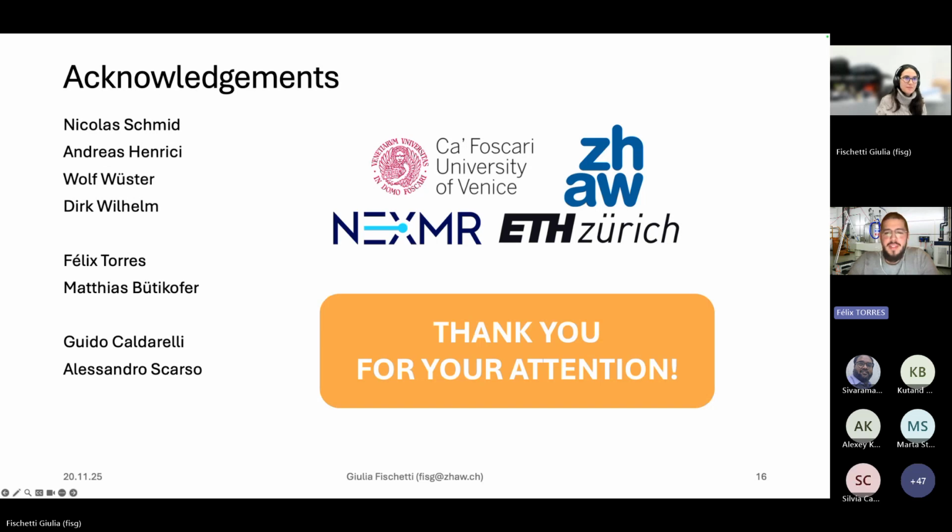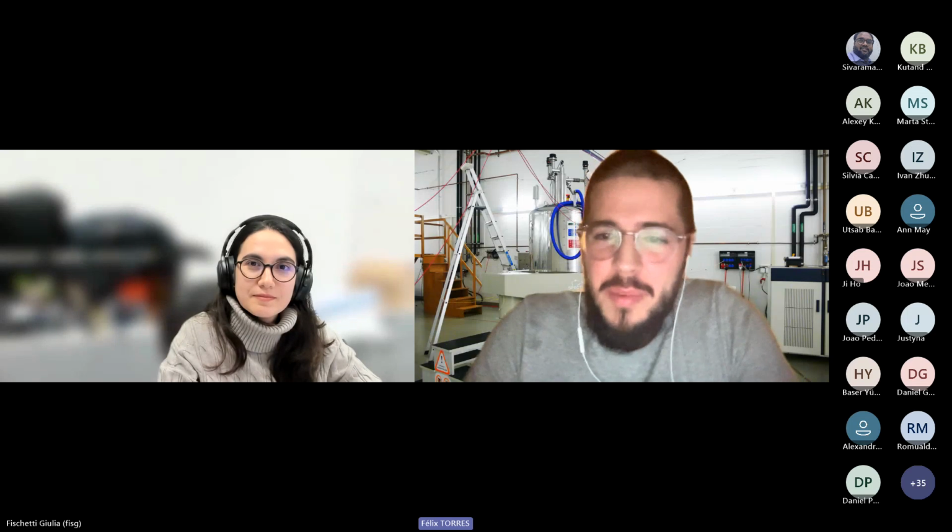Thank you very much, Giulia, for the very nice talk. It's really nice to see all those data again and to see them presented like this. We have some questions in the chat, and I will start with the first one from Thomas Evangelidis, who is asking to which extent the graph neural network has been benchmarked for chemical shift, and was it benchmarked for more diverse structures than fragments, like drug-like compounds, and if you have the MSE and RMSD values for such compounds.